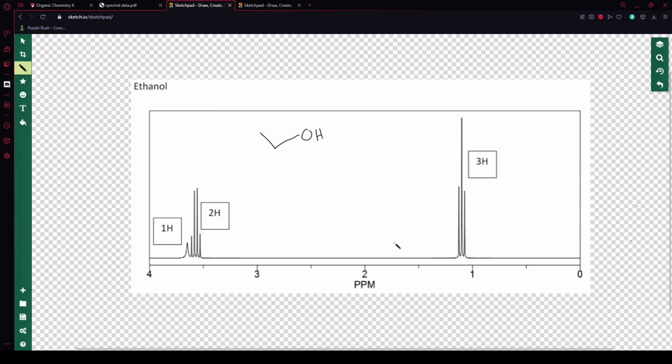All right. So, when I look at an NMR graph, I'm looking at four things. The first is the number of groups of peaks. So, here we have one little peak by itself. We have two, a set of four peaks or a quartet, and we have three, a set of three peaks. And these peaks are going to tell us the number of unique hydrogens.